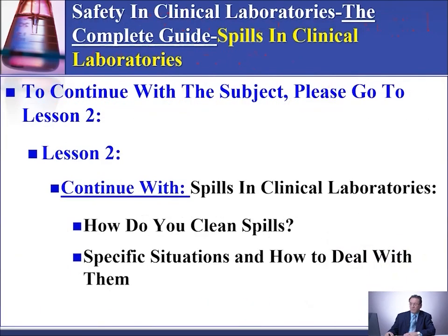I am done with lesson 1 on spills in the clinical laboratories. To continue with the subject, please go to lesson 2, which is the last lesson on this topic, where we will continue with spills in the clinical laboratories, and we will be talking about how to clean spills, specific situations, and how to deal with them.